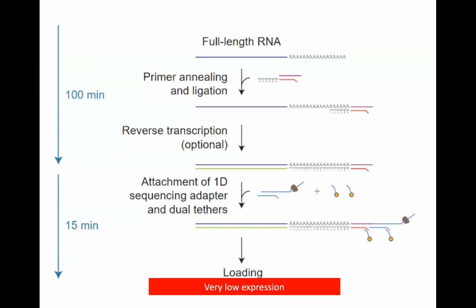Of course, another issue sometimes is that some of these non-coding RNAs may be low expressed. And until recently, the main platform that has been used by people doing nanopore sequencing has been the MinION, which has, however, a low yield of 1 to 5 GB. But a few years ago, with the introduction from Nanopore of a higher yield sequencer, the PromethION, that problem is also to some extent mitigated.